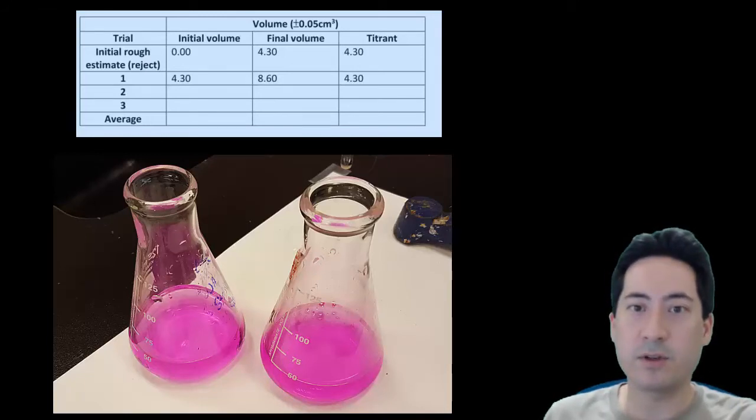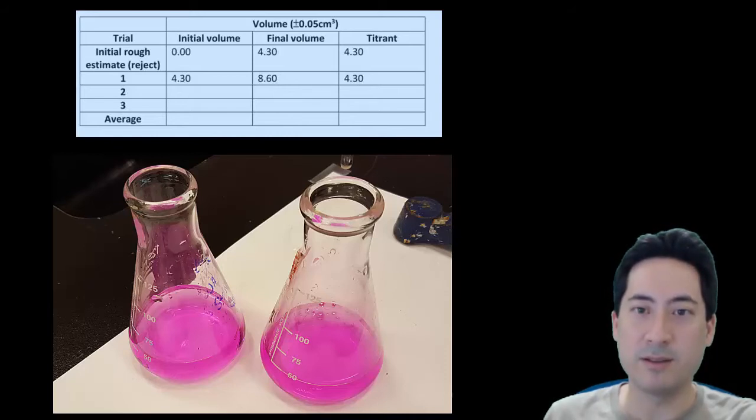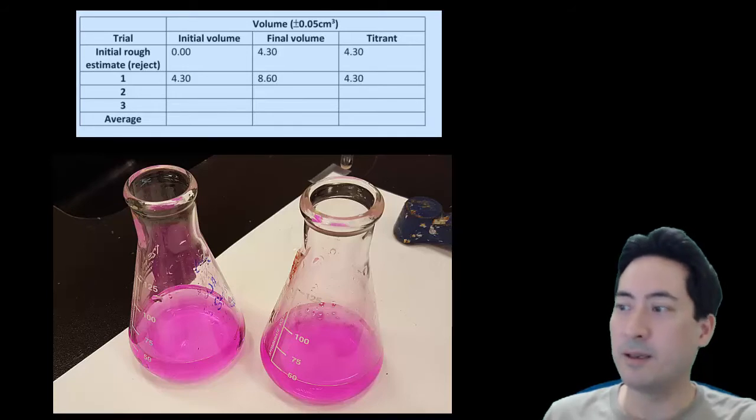These are the two titrations I did with the three molar acid. Now, because I knew what the concentration was from the first titration, my rough trial was fairly accurate straight away. I really went down to what the answer really should have been. And I got 4.30 both times. I got 4.30, then 8.60.